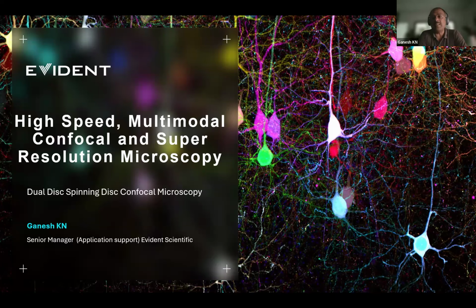I don't call it a disadvantage. Each and every technique addresses some of the issues of the conventional confocal microscopy technique. While doing so, it has its own limitations. So it is not the final solution for all imaging requirements.